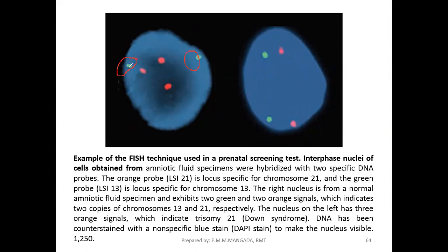These are detected using your fluorescent reporter molecule na fluorescein isothiocyanate. This one naman are stained by your acridine orange, itong mga orange dyan. The orange probe na ginamit is labeled.